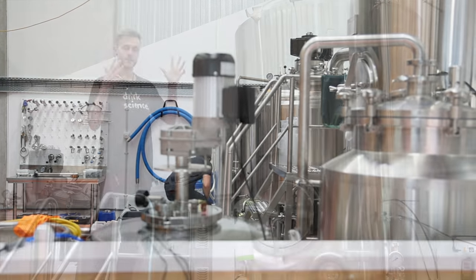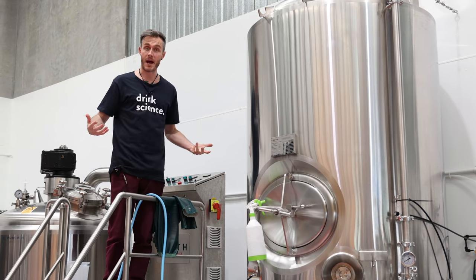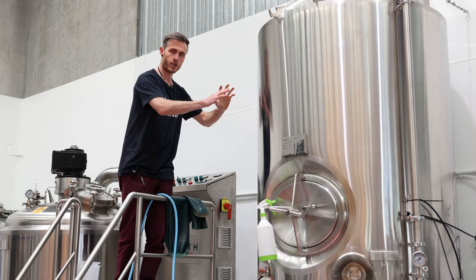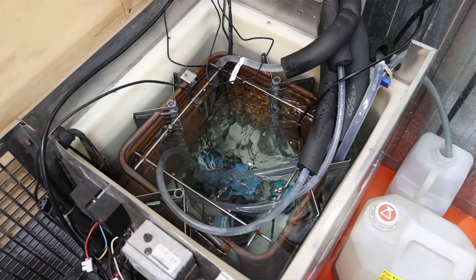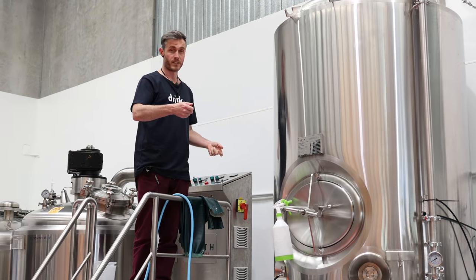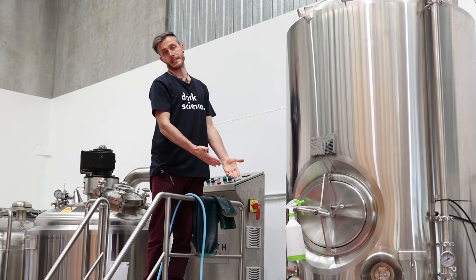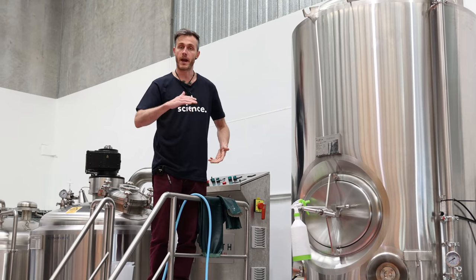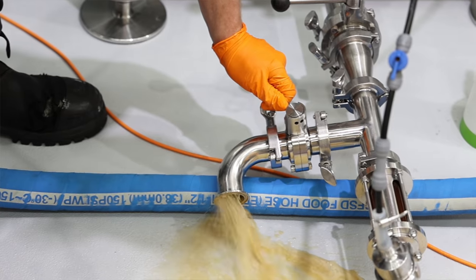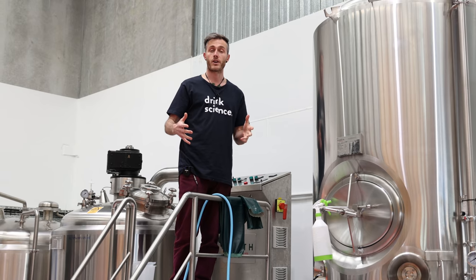Once the propagation in this final stage is finished, there's about a hundred trillion yeast cells in here, and we need to get them out and separate them from that spent wort to be able to send them to breweries. This tank has got a glycol jacket in the wall that allows us to control the temperature. At the end of the final stage, we set that to crash cool down to two degrees. With that colder temperature, all the yeast cells fall down and flocculate into the bottom cone. As they pack and condense, we're able to drain off the spent wort and package the pure yeast slurry straight out the bottom of the cone into our yeast holding tank, ready for packaging.